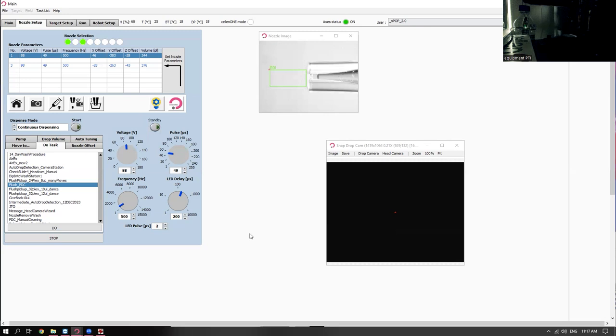What I'm interested in is studying the profiles of these different single cells at different stages. So, is there a way that we can annotate or isolate at this level cells that have these different stages of growth? I don't want to see it. I just want to see them in the nozzle, right? It's possible if they absorb more light, maybe you have darker particles, and it's one thing that we can differentiate, which is the hemozoin crystal.